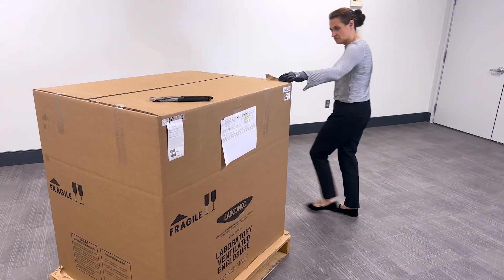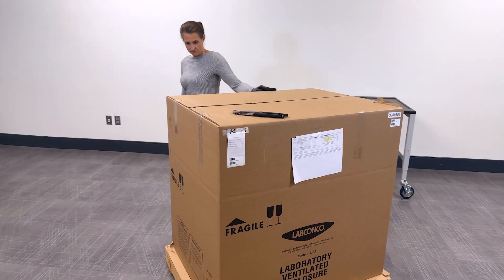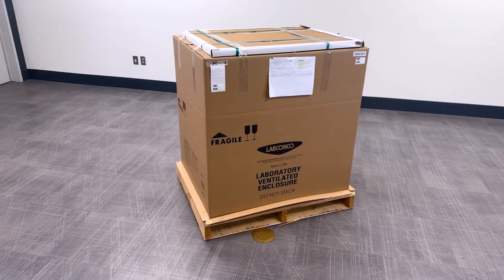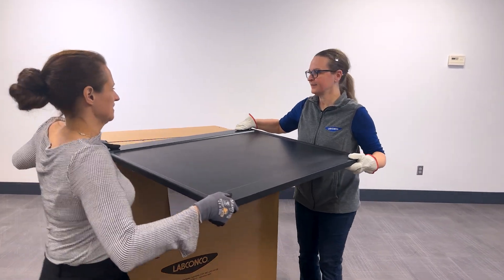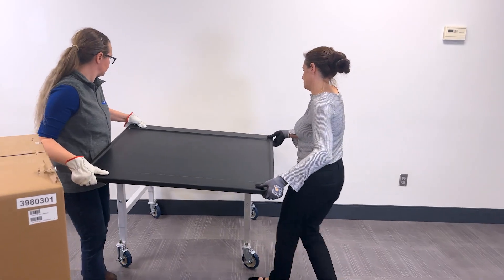After your package arrives, carefully inspect the carton for any damage that may have occurred in transit. If a work surface was ordered with the enclosure, it will be shipped on top of the unit, under the enclosure, in the pallet, or packaged separately. If the work surface is on top of the enclosure, remove it now and place it aside in a safe location.